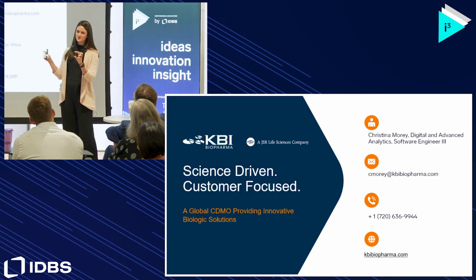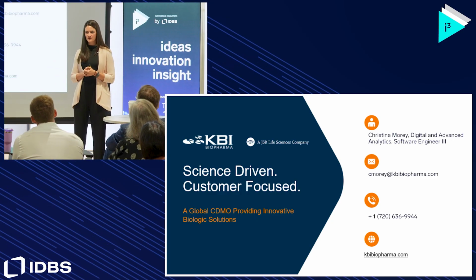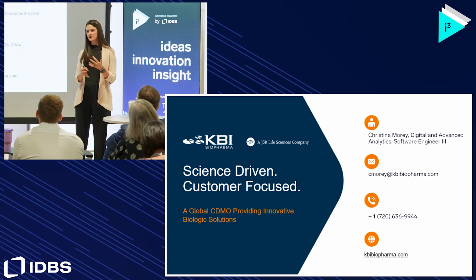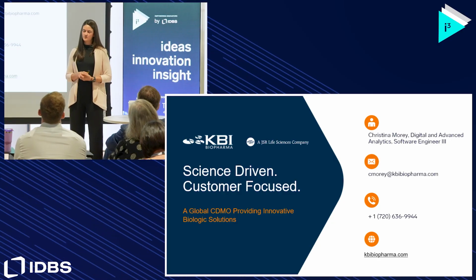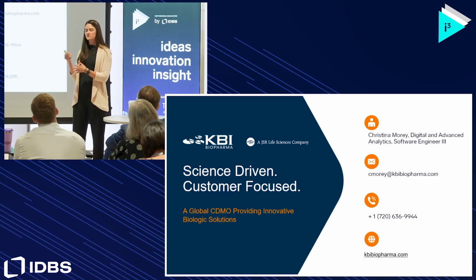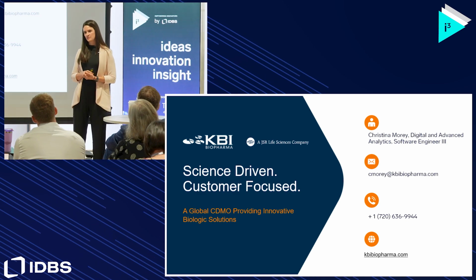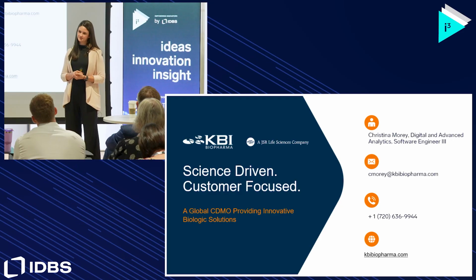a banner at the top of PROGRAMview that says this is a non-validated system. If you're going to use this data for regulatory use, please contact us. So none of it is validated. We do have a ton of testing on every aspect of our pipeline, so when we do decide to validate, hopefully we're set up well for that. But as of right now, if the clients are going to use this data for any sort of regulatory decisions, we'll have a discussion about that, and we can confirm the data before we give it to them. Okay, perfect. Thank you.